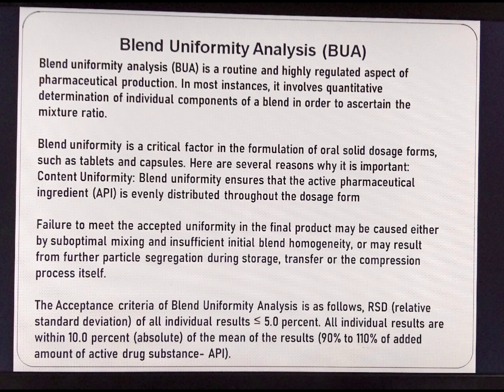Blend uniformity analysis, BUA. Blend uniformity analysis is a routine and highly regulated aspect of pharmaceutical production. In most instances, it involves quantitative determination of individual components of a blend in order to ascertain the mixture ratio. Blend uniformity is a critical factor in the formulation of oral solid dosage forms, such as tablets and capsules.